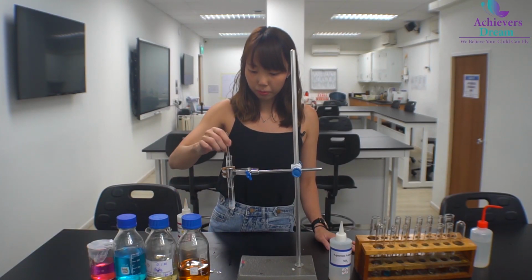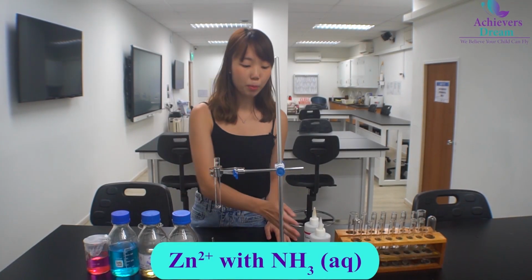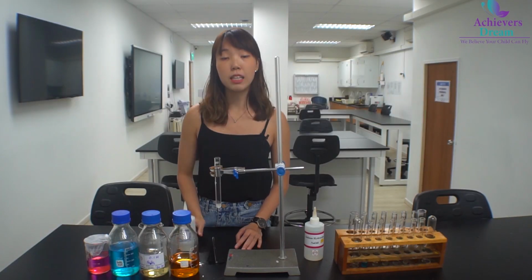Okay, so now I'm going to add in excess sodium hydroxide, and I'll be using a glass rod to stir. As you can see, the white precipitate dissolves in excess sodium hydroxide. Okay, so next I'm going to add in a few drops of aqueous ammonia. As you can see, a white precipitate is formed.